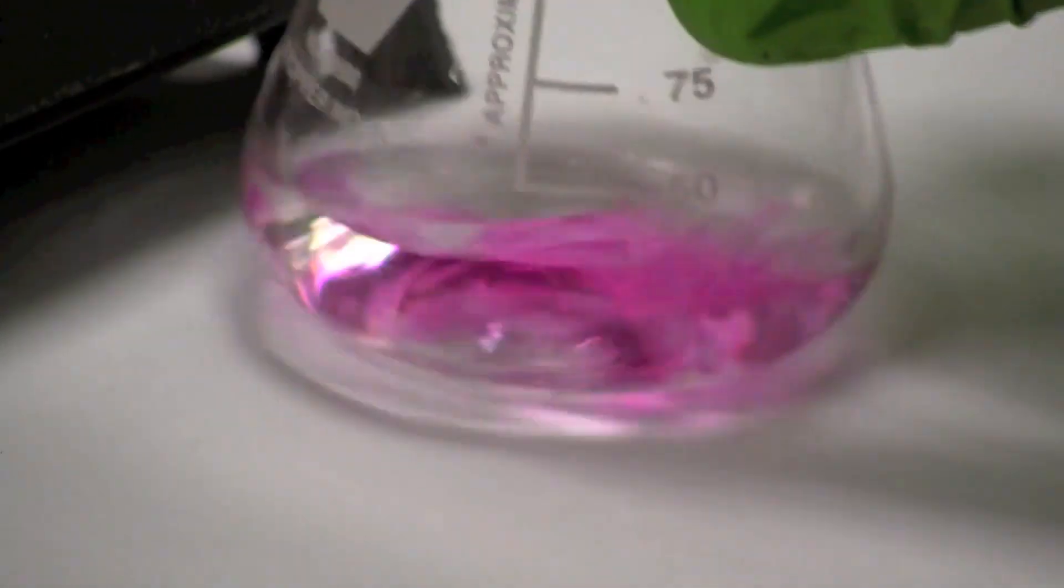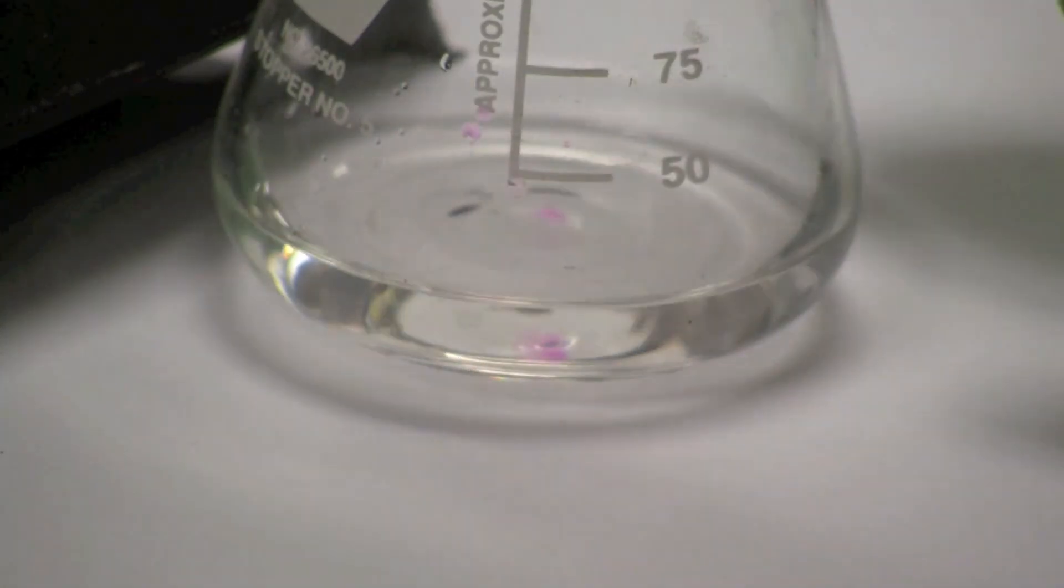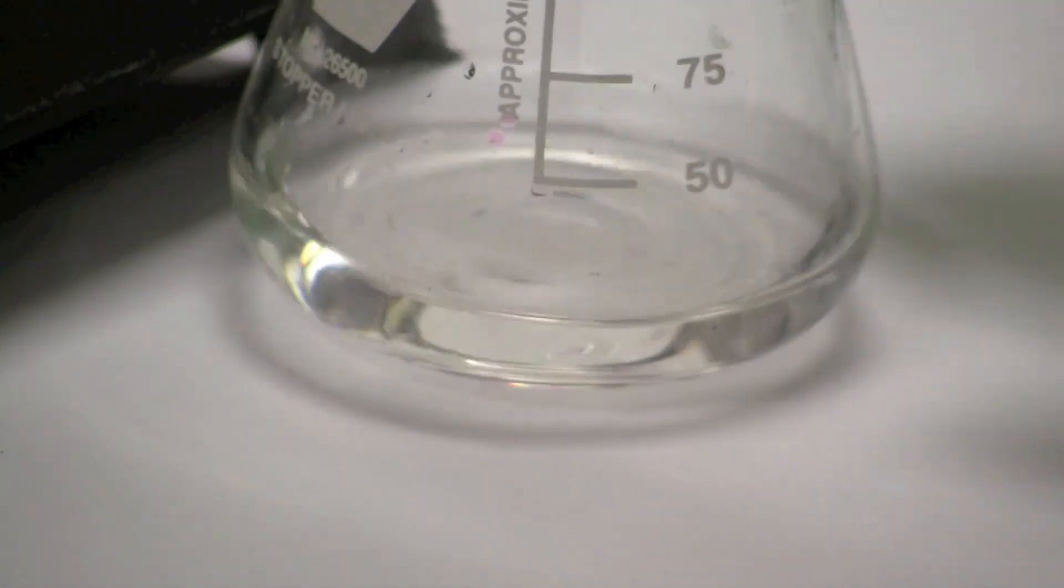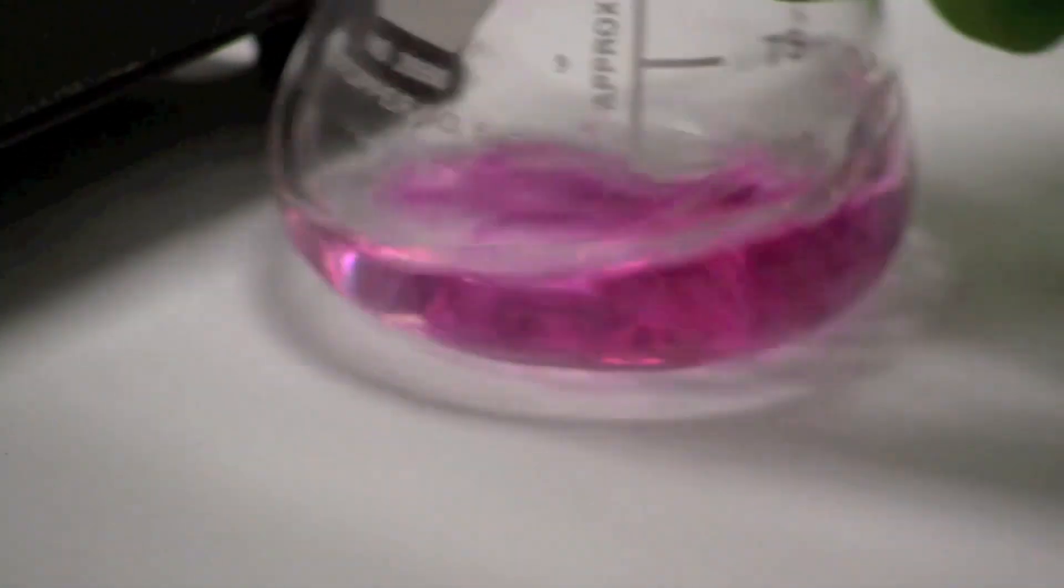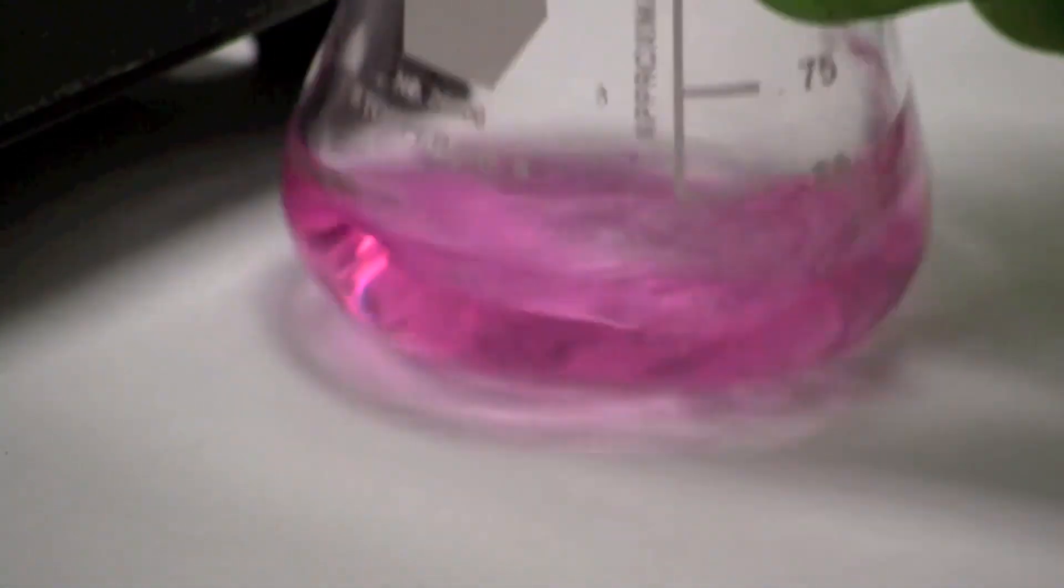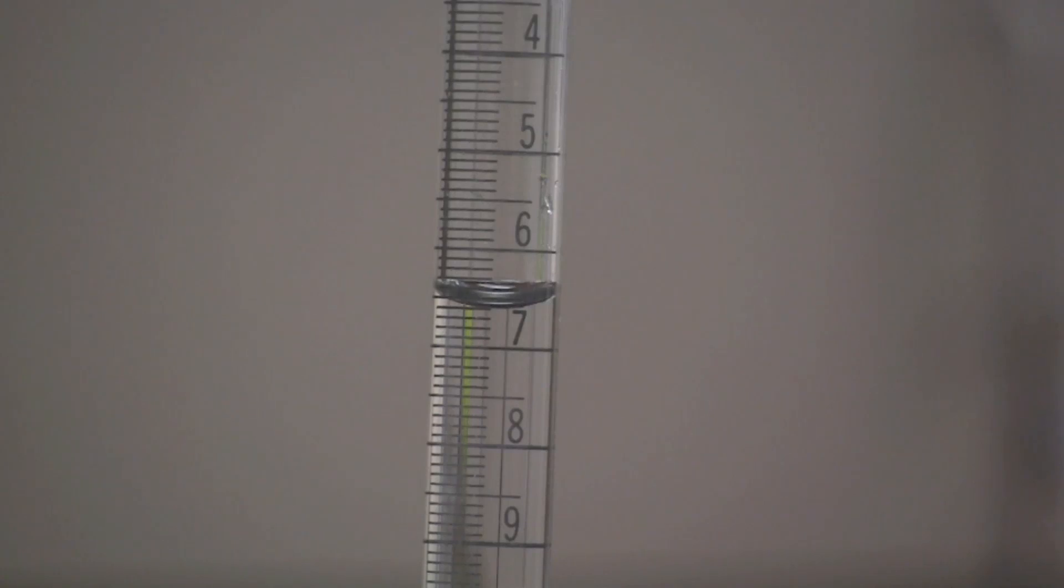Then add the sodium hydroxide solution in single drops, making sure that each drop is thoroughly mixed before adding the next. Continue to add sodium hydroxide one drop at a time until the hydrochloric acid solution stays pink, indicating that the acid has been neutralized.